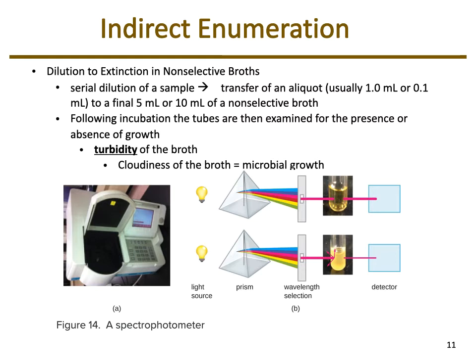Because we have different dilutions, and hopefully a standard with this, we can take that absorbance and work back to figure out the concentration of our unknown sample. So you're not directly counting; it's because of the absorbance reading and using a standard curve that you determine what the concentration is.